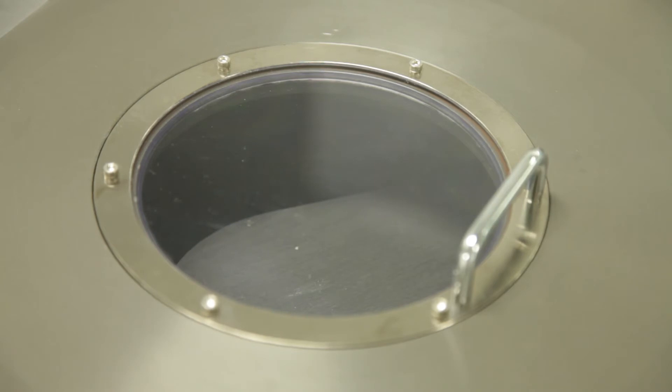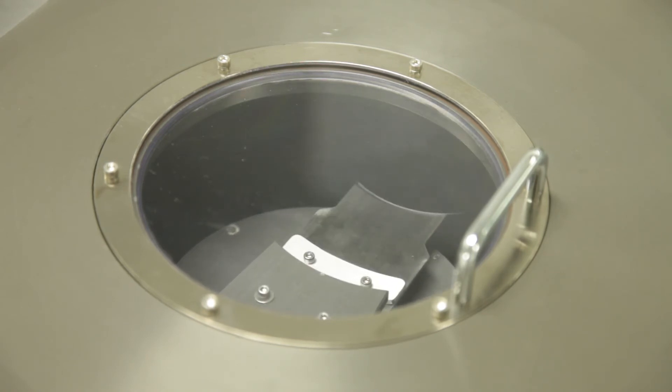Our system has a load lock chamber, which can be quickly vented to help in loading and unloading samples without ever exposing the user to the chamber. Using the software, you can vent the load lock and open the lid with the touch of a button.